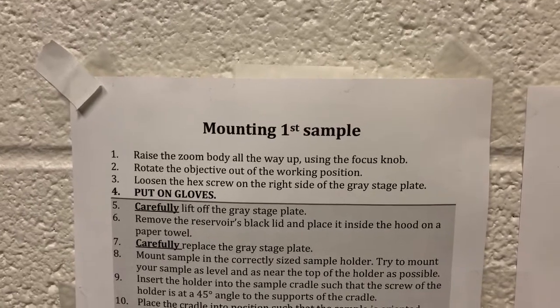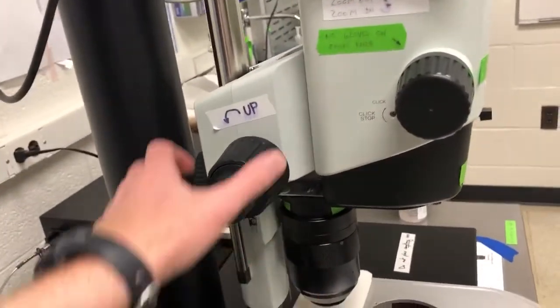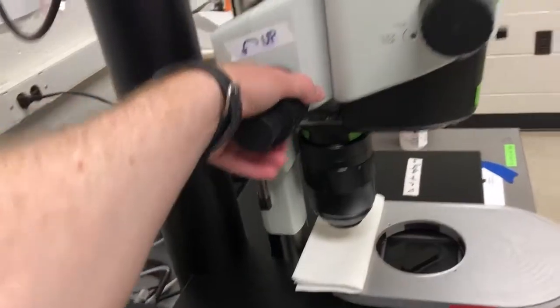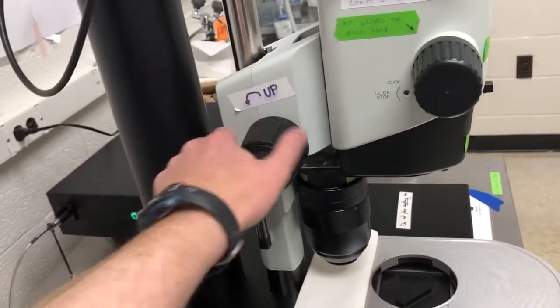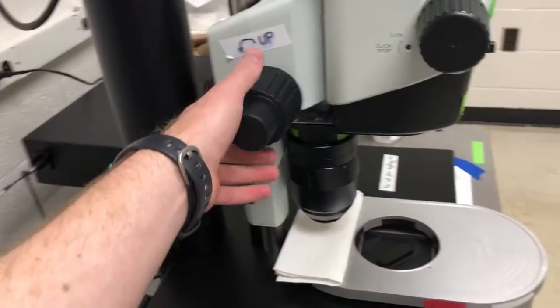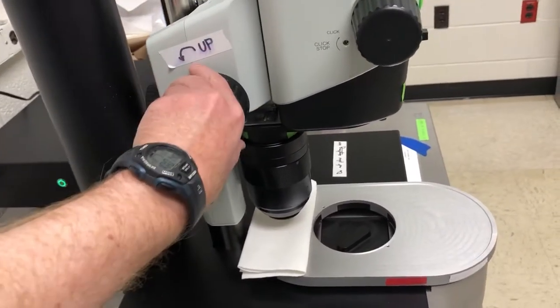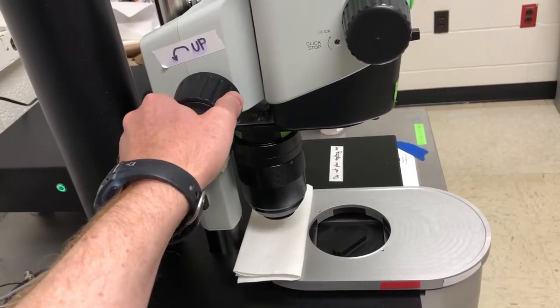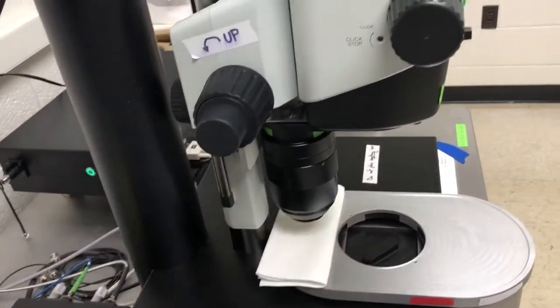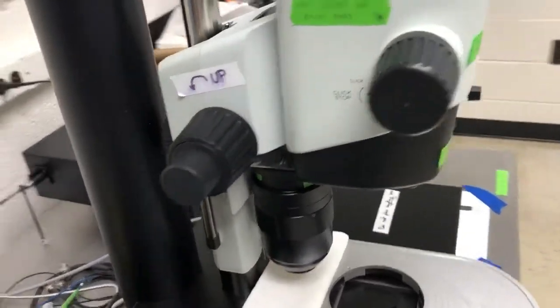Step one is to raise the zoom body all the way up using the focus knob. The zoom body is this whole part of the microscope, and you move it up or down with this knob. Turning it away from you — towards the wall — moves it up. It has to be all the way at the top. If you can't move it, that means it's already all the way up.